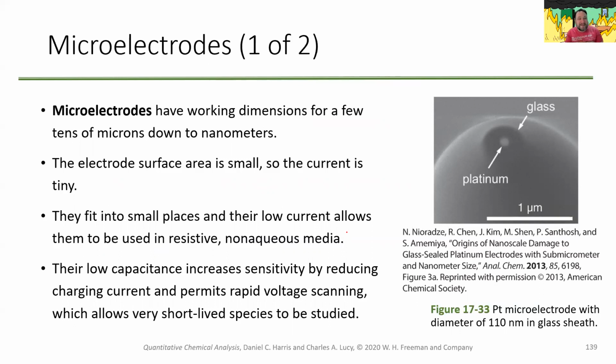So microelectrodes, these are if you want to stick something into a rat's brain and figure out what's going on. You can stick it into a human brain too. They're really, really small. So you make these by basically taking a capillary tube and heating it and going whoop and stretching it. You can put that into a micropipette puller, and a pipette puller is just a mechanical tool that will heat and pull for you, so you get more reproducible results.